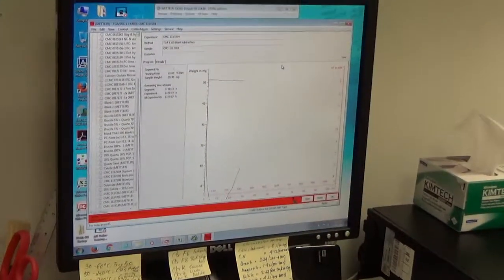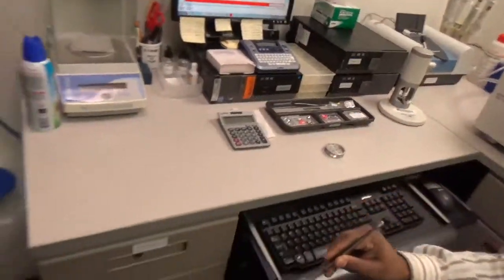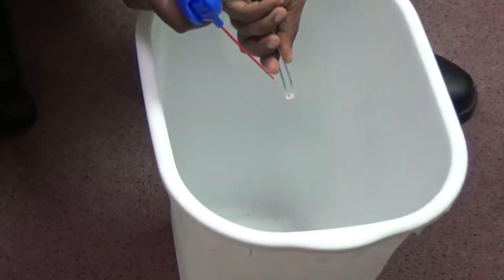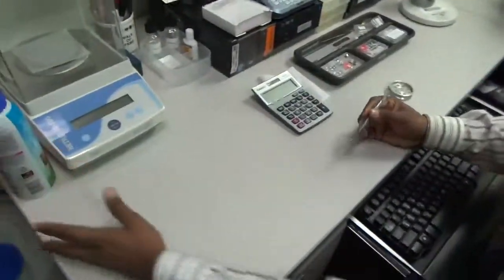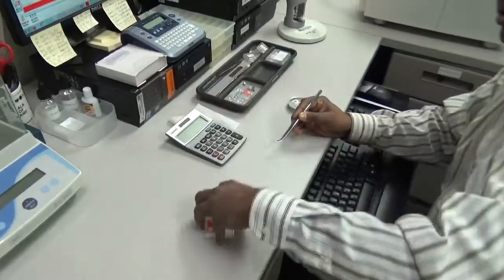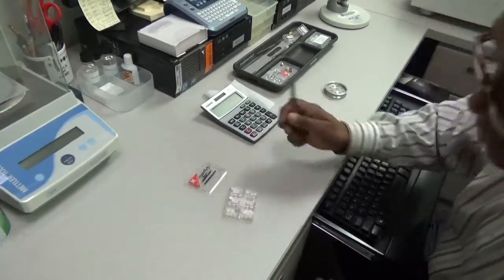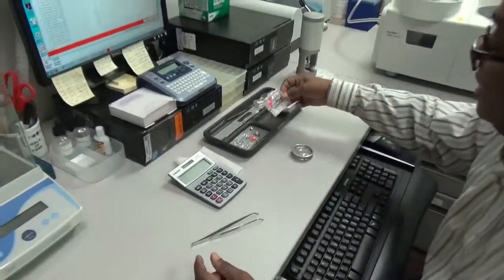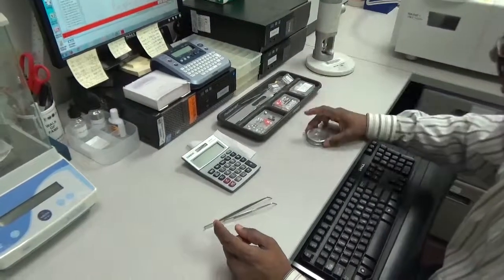Once we get the individual endotherm results, we copy and paste into Excel. That's how we determine each phase's decomposition and the corresponding quantitative amount. So that's how we do our thermal analysis. When an old sample is done, we basically take the crucible and blow compressed air to remove the sample. After removing the sample, we clean it in alcohol ultrasonically, keep it in the used crucible box, and once we have enough, we clean them ultrasonically. Then we heat them around 900 to 1000 degrees in a muffle furnace to remove any residue, and then we can reuse them.